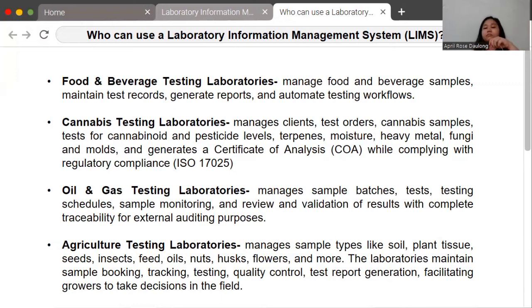So, say magapon siya maka-track yapon sa mga records na yapon siya maka-test sa management. So, pag-track ang mga data informations para manage na sa LIMS. Kaya makaproduce po dito siya accurate na mga data. Accurate na mga data and informations. And hassle-free siya. And in other words, efficient ang LIMS.